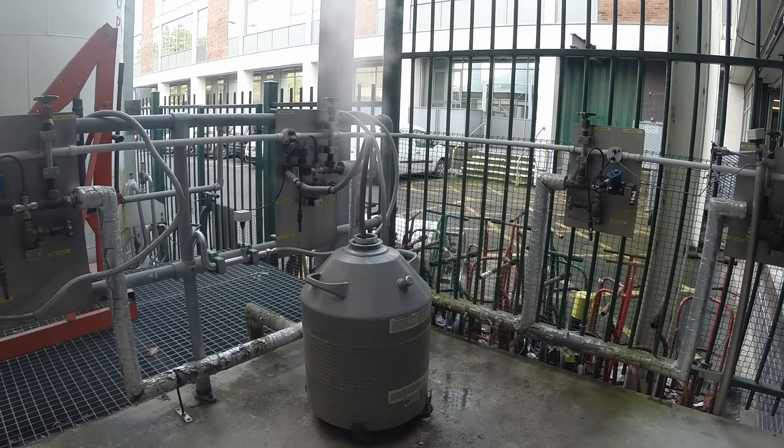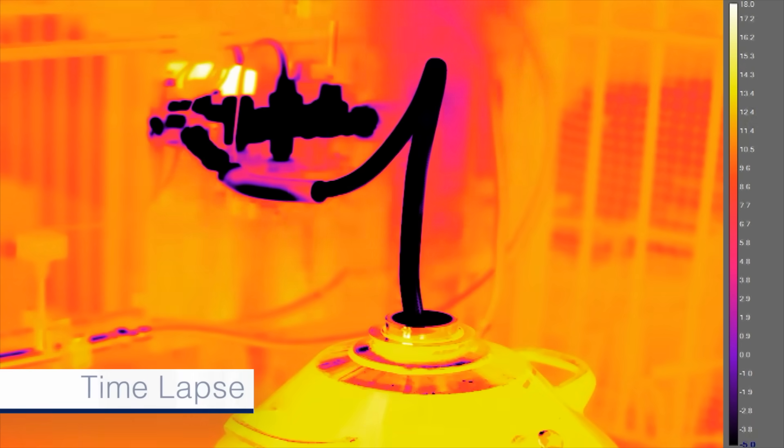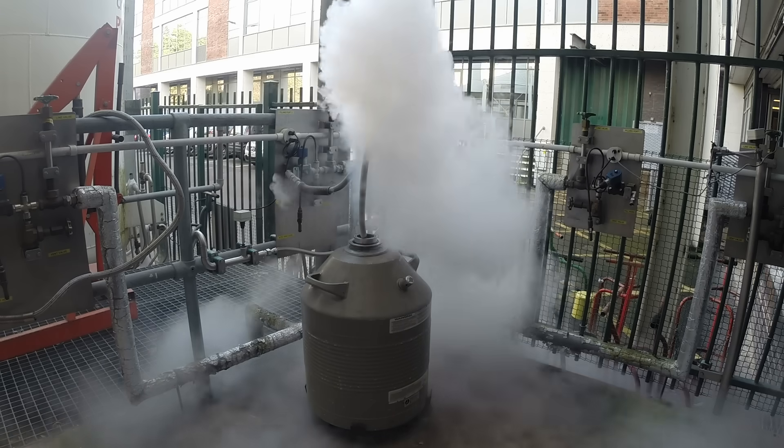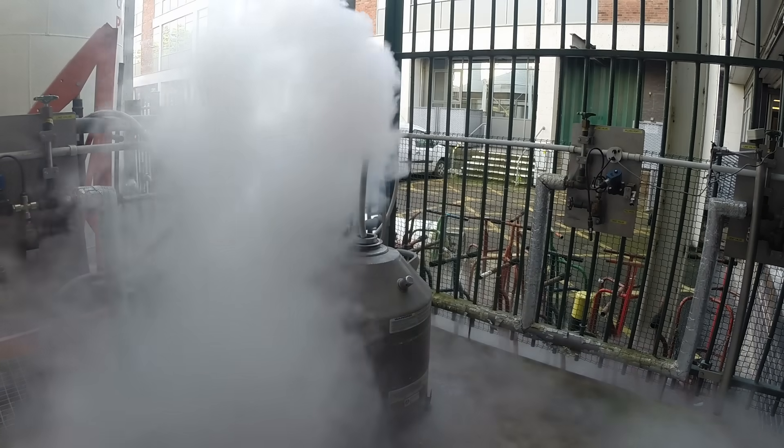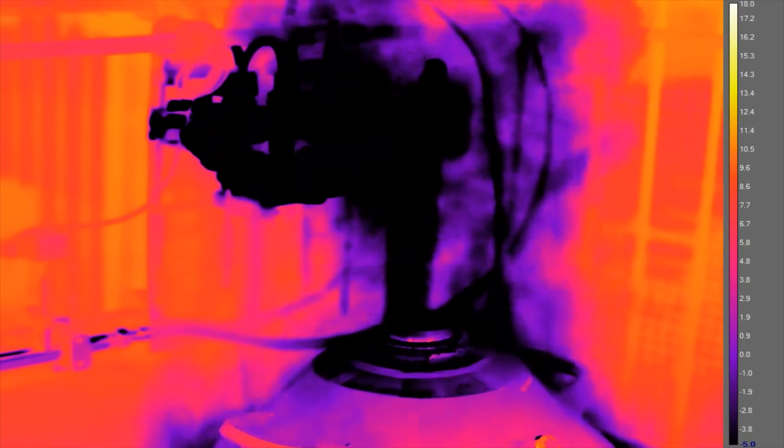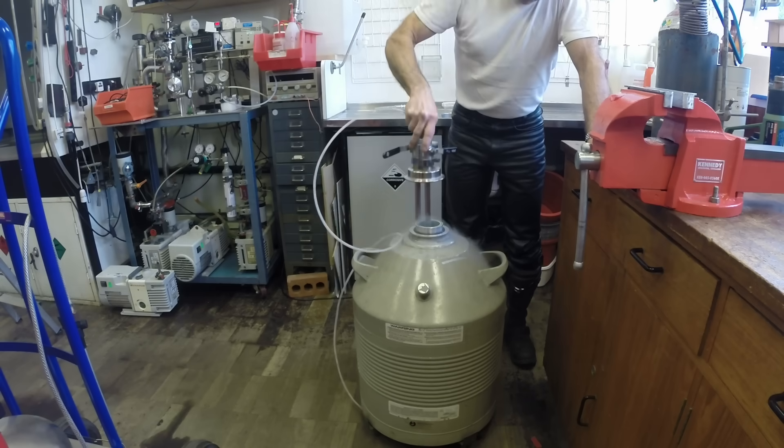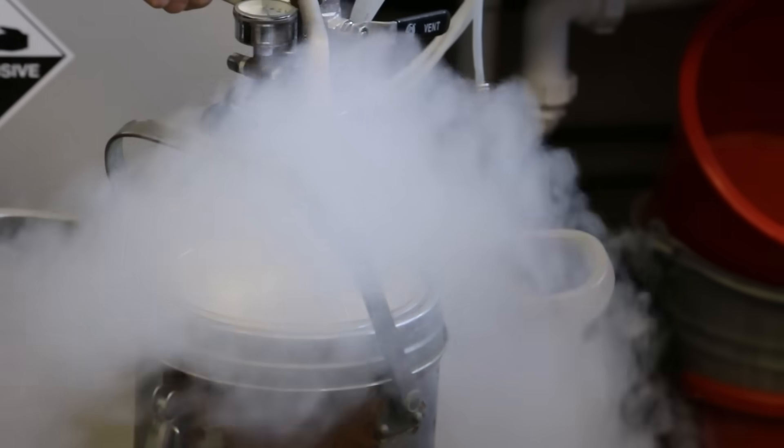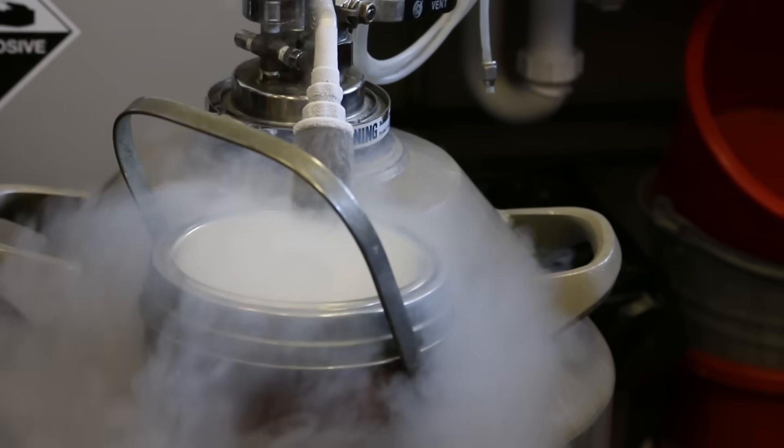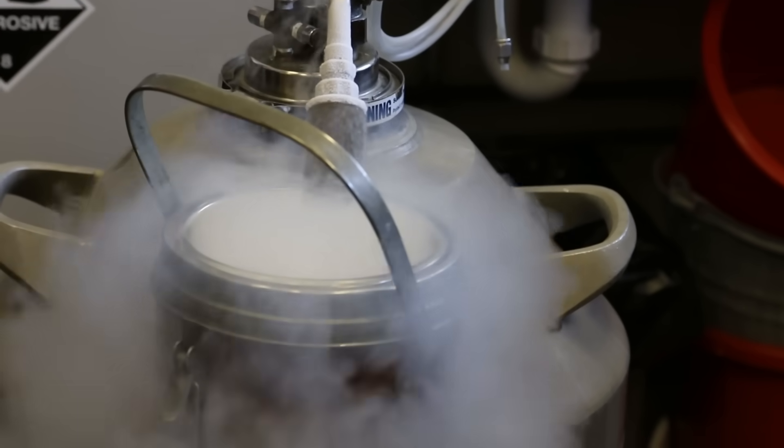Liquid nitrogen, which boils at minus 196 degrees centigrade, is used as a coolant all over the world in laboratories and industrially. When nitrogen comes out of the container, it's obviously cold, and you can see in the thermal imaging how the low temperature cools everything around it. It also freezes the water vapor in the atmosphere. So you get quite nice clouds of what look like steam, but it's actually tiny particles of ice.